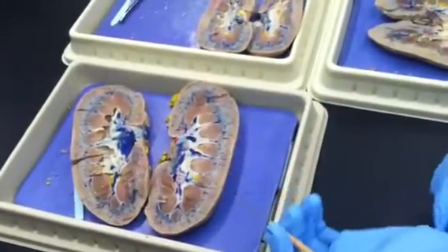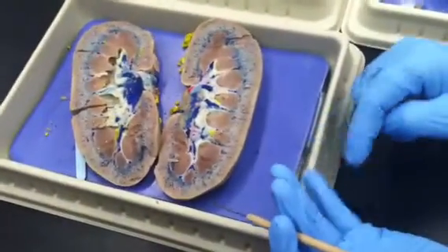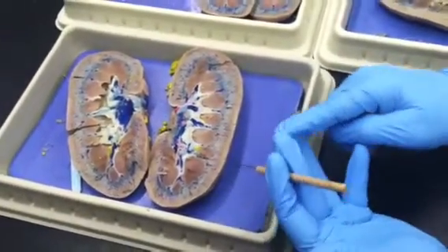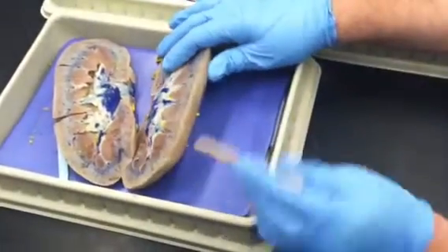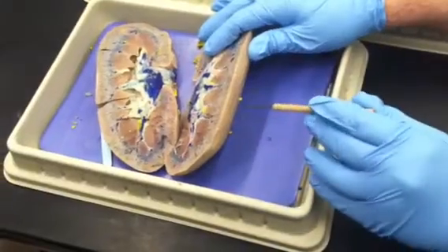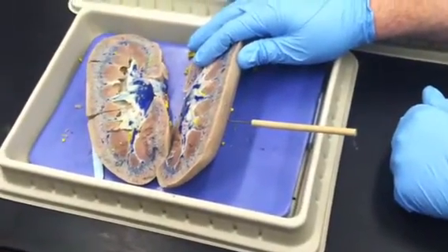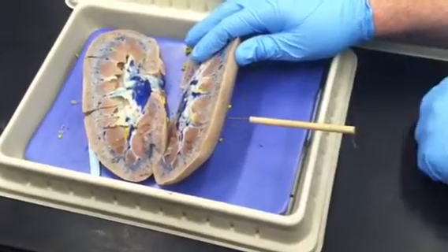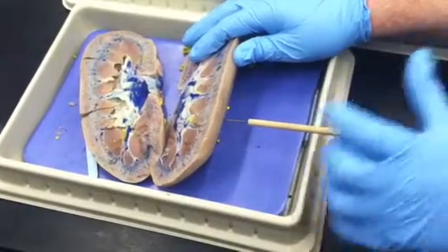Okay, so if I start with the three layers: the capsule, the cortex, and the medulla. Renal cortex, renal capsule, renal medulla. Typically, if I ask about the renal capsule, I would just stick my probe in the outside of the kidney and say, what layer is this probe sticking through first? And it's sticking through what would be the renal capsule.